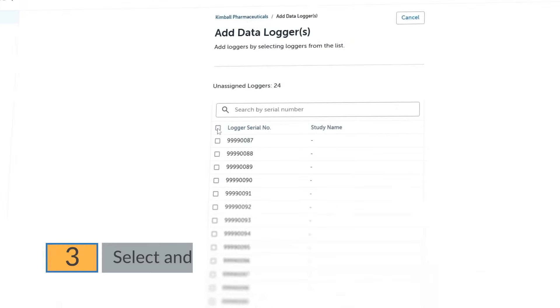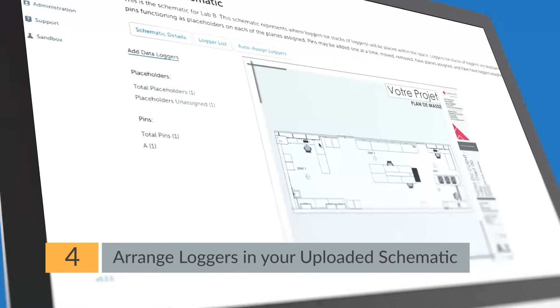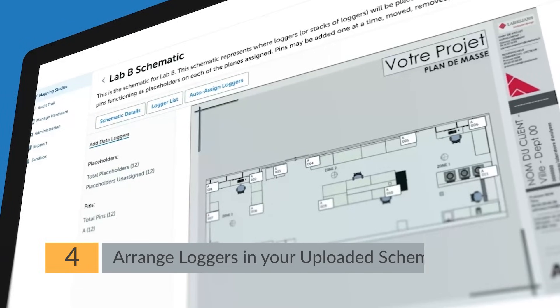Step 3: Add loggers. They're instantly recognized and ready to go. Setup is simple, from small chambers to large warehouses. Step 4: Set logger locations in the Dixon Mapping Suite. Drag and drop each logger to a location in either a 2D or 3D schematic for reference.